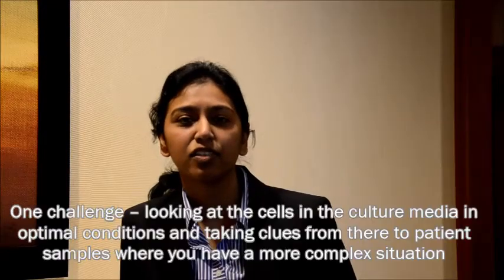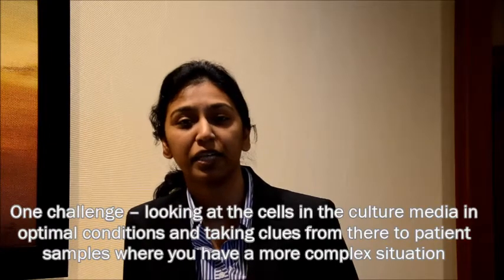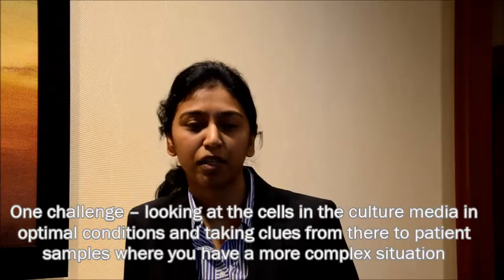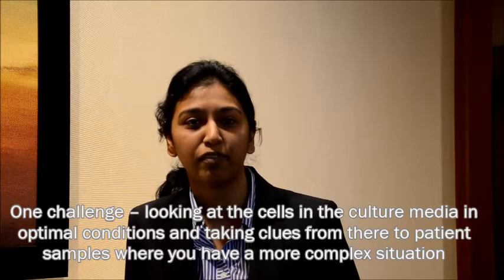So one of the challenges of the field is looking at the cells when they're in the culture media, in optimal conditions, and taking the clues from there to actually go for patient samples, where you have a much more complex situation, and using that as a diagnostic tool and whether it has significance. That's the challenge, and that's the exciting part of the whole concept.